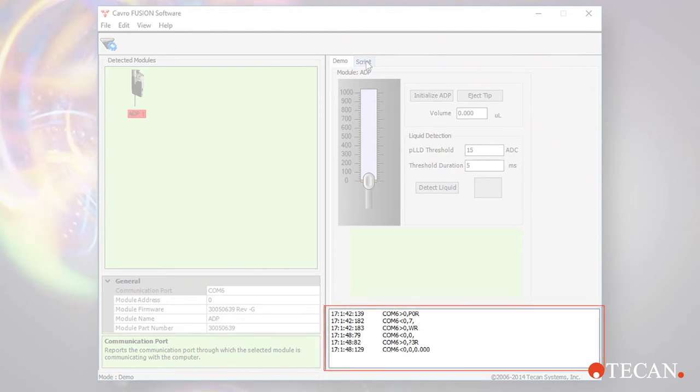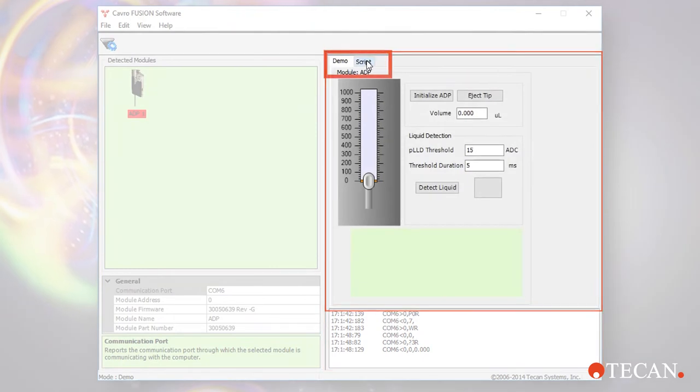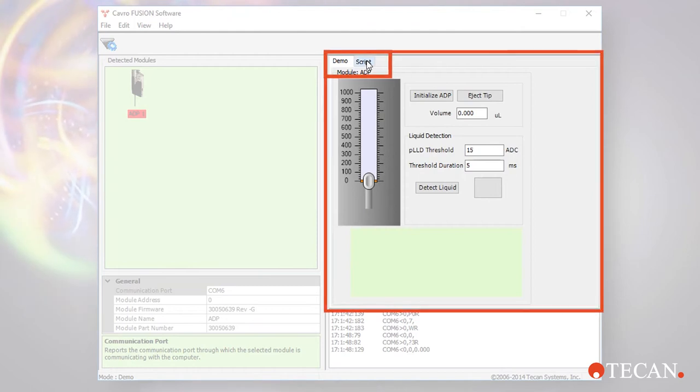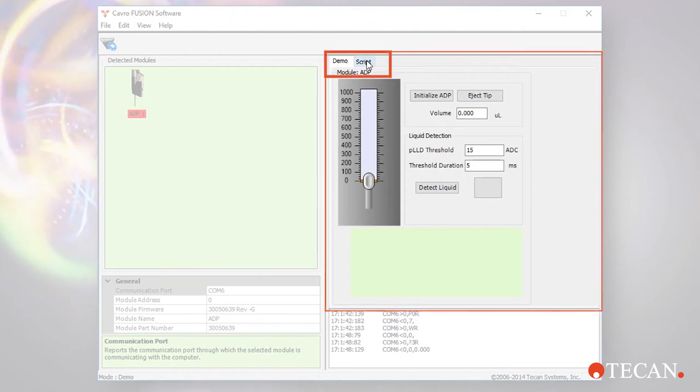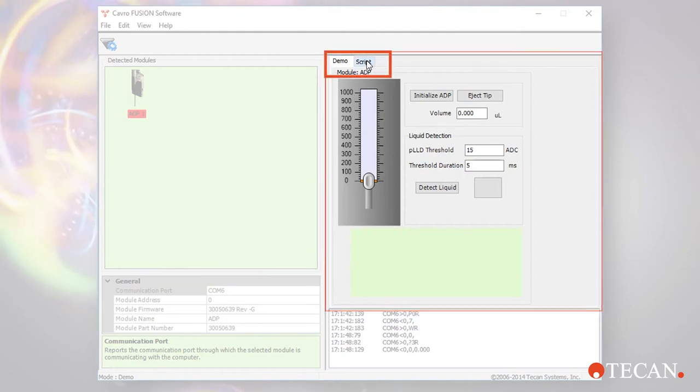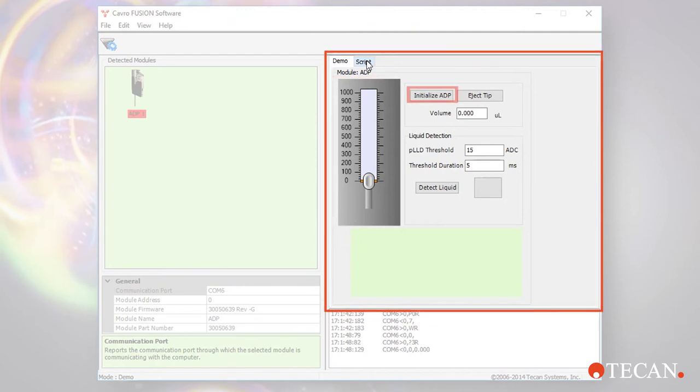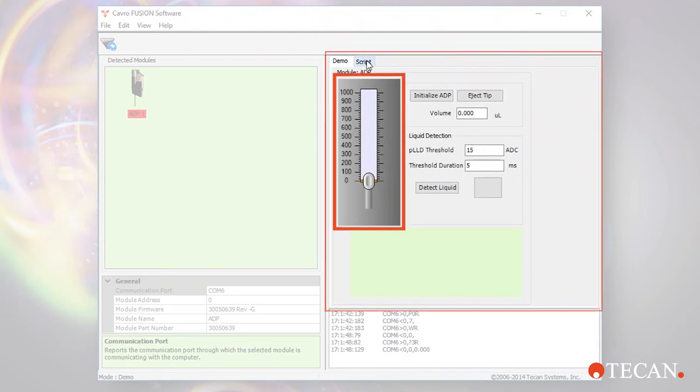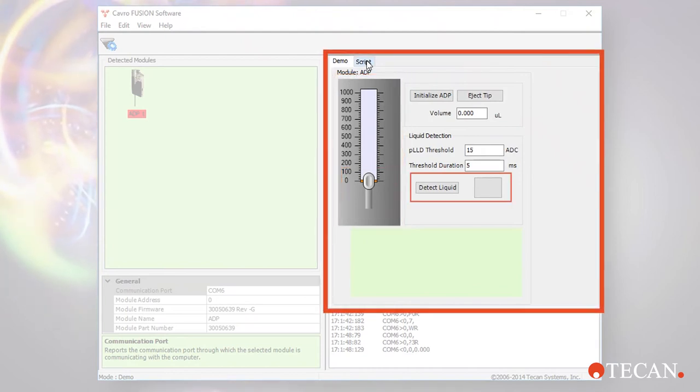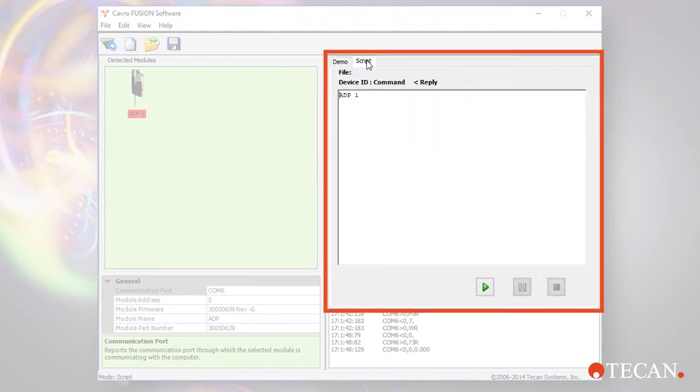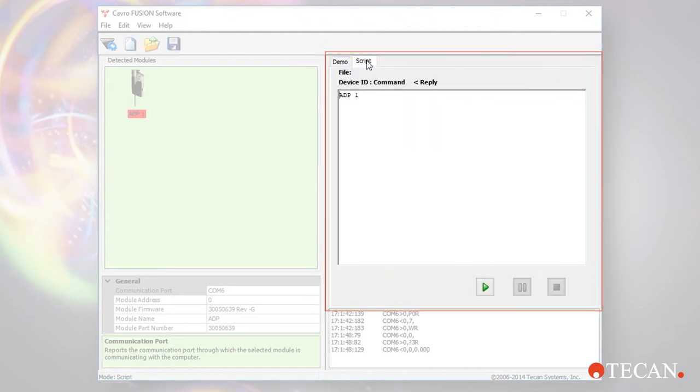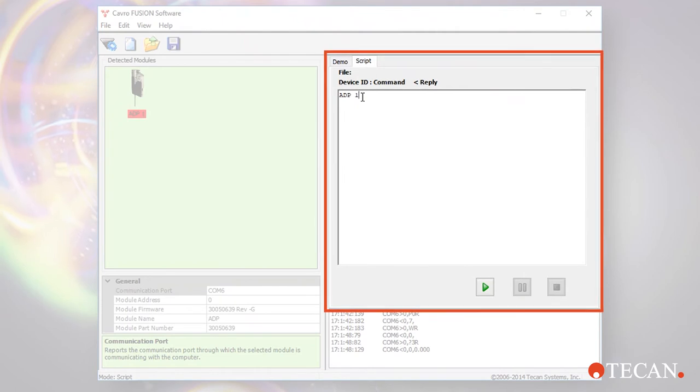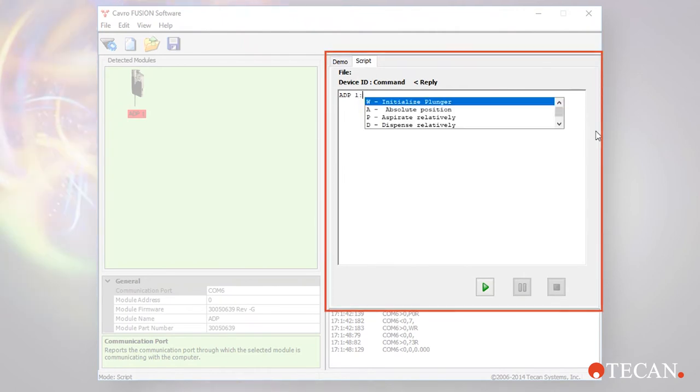The log pane at the lower right is a communication snapshot displaying commands that are sent to and from the device. The modules pane at the upper right contains two tabs: the demo tab and the script tab. The demo tab is a simple drag and drop push button interface to visually demonstrate a few key features of the ADP, such as initialization, plunger movement, the disposable tip presence sensor, and use of the pressure sensor for liquid level detection. The script tab is a versatile text-based command interface window to write, test, and run test scripts.